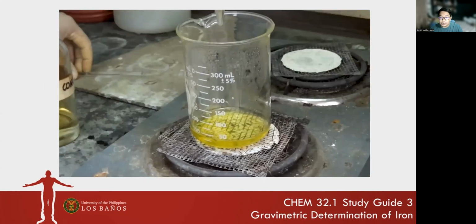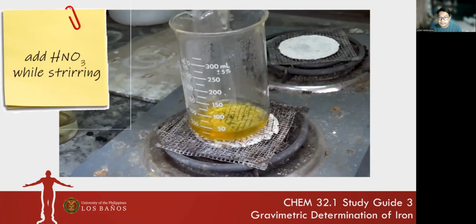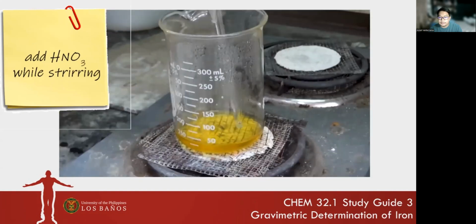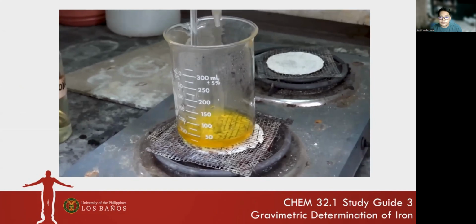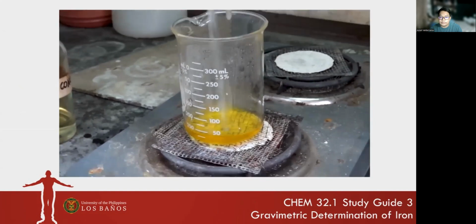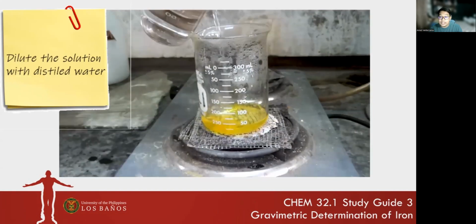So in this portion, we will be adding your nitric acid. And then you will dilute the solution using distilled water.